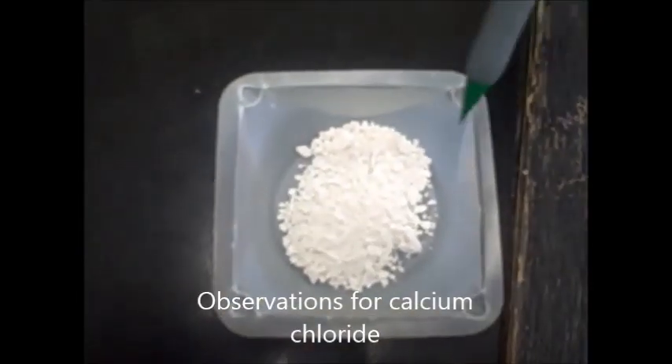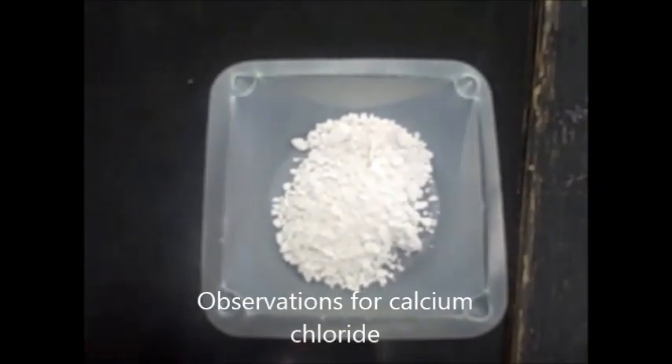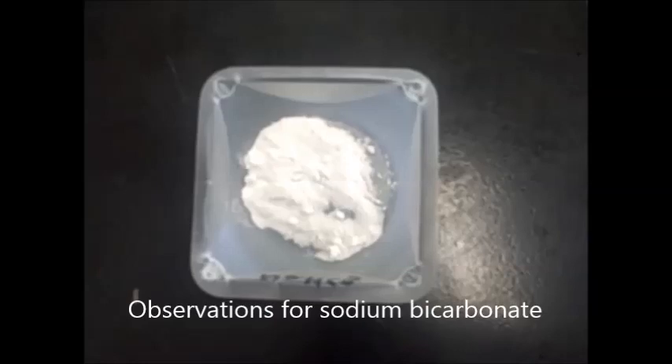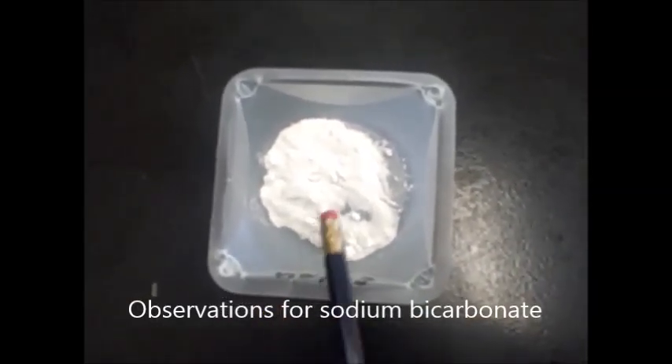All right, well, it's kind of like almost like rocks, kind of like little ones broken up. All right, this is the sodium bicarbonate, and it looks like snow almost, a little pebble inside, like snowballs.